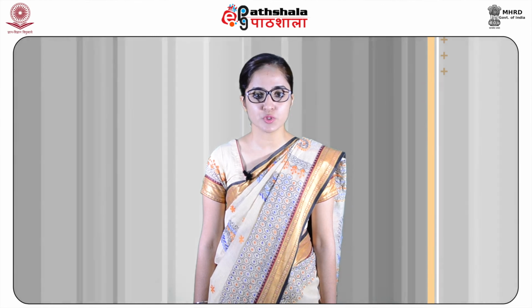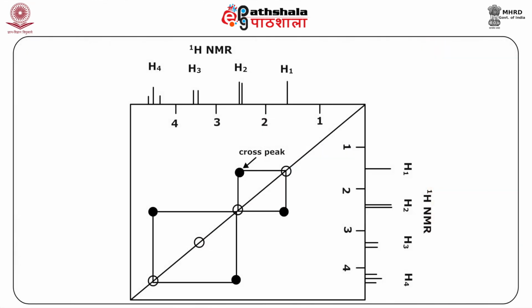Now each cross peak has x and y coordinates. One coordinate corresponds to the chemical shift of a proton, the other to the chemical shift of the proton to which it is coupled. Because the diagonal splits the COSY spectrum in half, each cross peak is duplicated on the other side of the diagonal with the same coordinates in reverse order. Therefore, we need to examine only one half of the cross peaks. To examine the COSY, we start with a cross peak and draw two perpendicular dashed lines connecting to the diagonal. These lines are parallel to each spectrum axis. The peaks which are intersected on the diagonal by these lines are said to be coupled to one another.